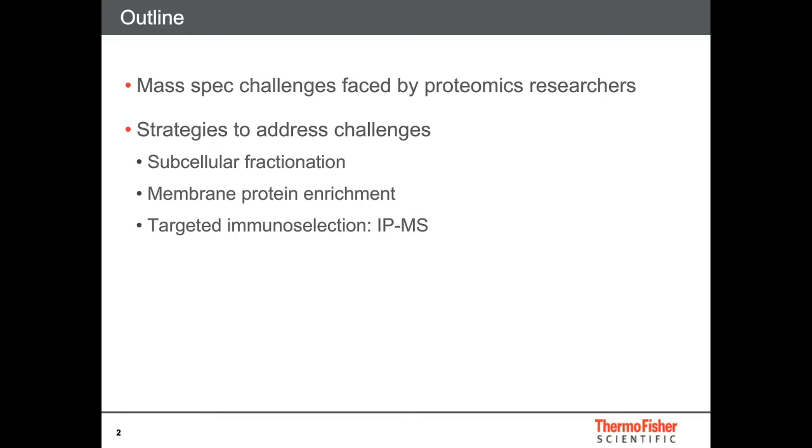Three of the strategies that we will cover in depth include subcellular protein fractionation, integral plasma and organelle membrane protein enrichment, and immunoprecipitation mass spectrometry, or IPMS, which is a powerful immunoselection technique for targeted mass spectrometry applications.